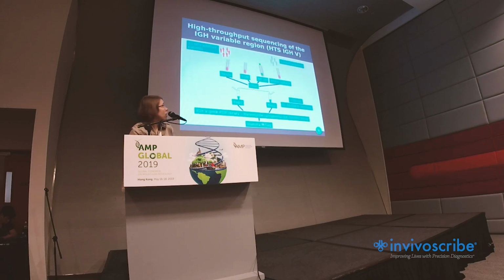Then we did our clonal analysis. For this we used only 22 HCV positive patients and 7 healthy donors. We used cell sorting to extract naive, class switch memory, non-class switch memory and CD5 mature B cells. Then we extracted DNA via QIAGEN kit and subdivided them into 2 replicates, each of about 10,000 B cells.